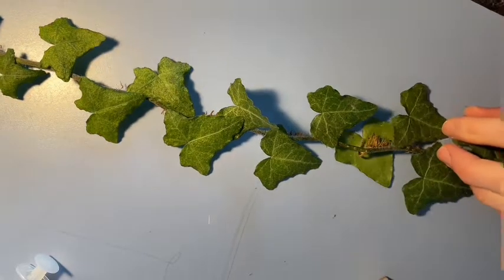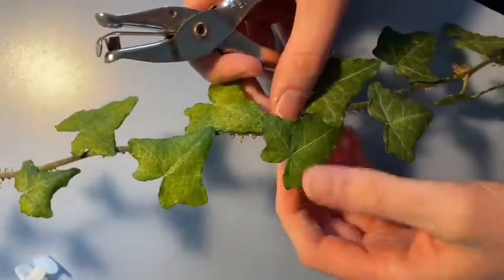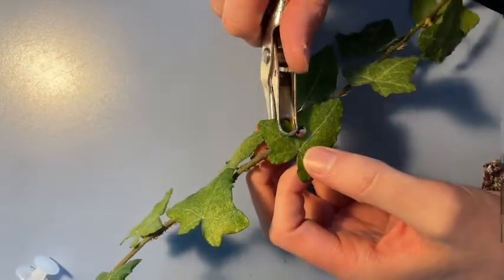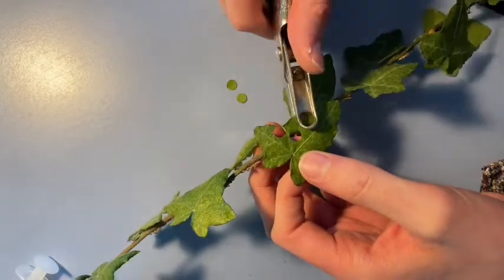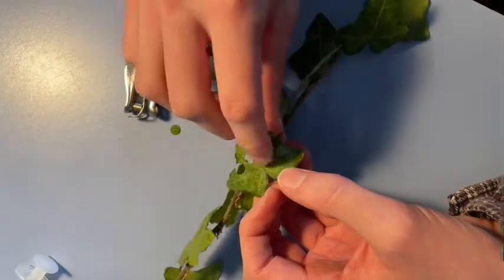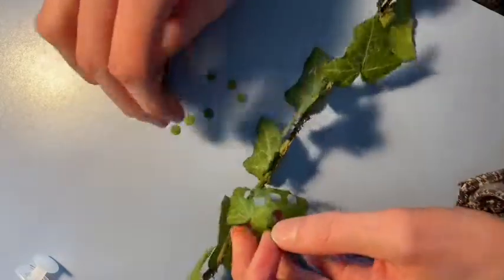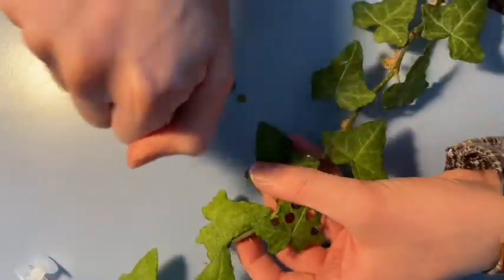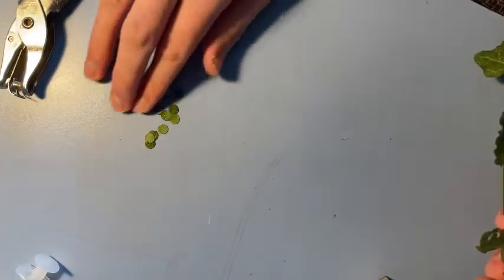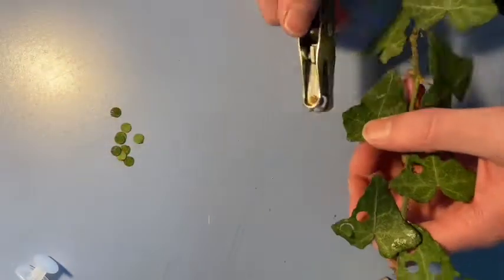Next, the students are going to have to cut up some different leaf discs, and they need exactly 10. Students can use their hole puncher to punch out those little discs. They should avoid main veins. To get enough hole punchers, I usually just go to the supply closet, where they have a bunch. Even if it's not this exact type, students can put the leaves underneath the paper hole punch and it works just fine. After you get 10 for the light experiment, we're also going to need 10 for the dark experiment.